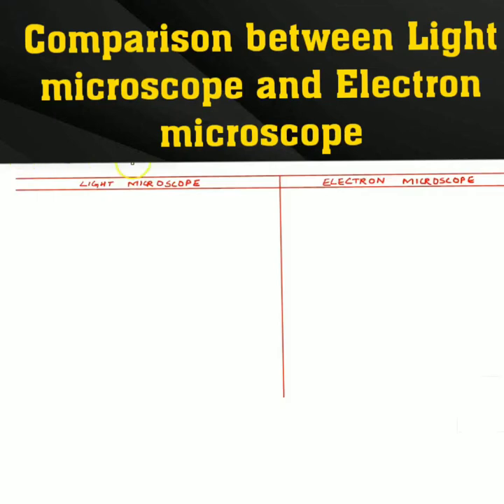Hello students, today we see the difference between light microscope and electron microscope. First of all, in light microscope, the energy source is the visible light to illuminate the specimen, whereas in electron microscope, the beam of electrons is used to illuminate the substance.